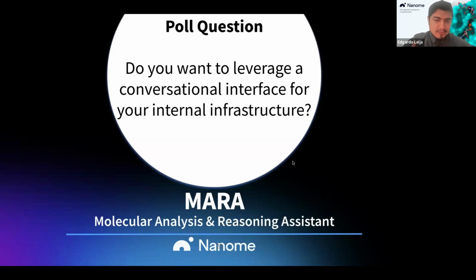Scientists know what they want to do, and if they could have this conversational interface to make life easier, instead of having to work through whatever existing systems are in place, regardless of their complexity or simplicity, this is a great way to help automate some of the high cognitive load tasks that shouldn't take that much effort.